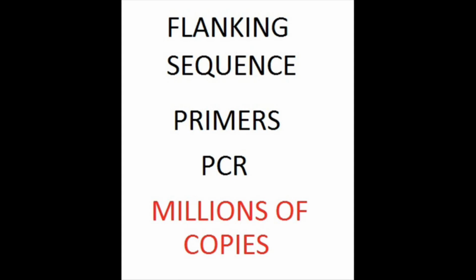It is used to amplify, or make more copies of, the sequence using PCR. The specific primers are added to lock onto the start of the STR. PCR makes millions of copies of this section of DNA.